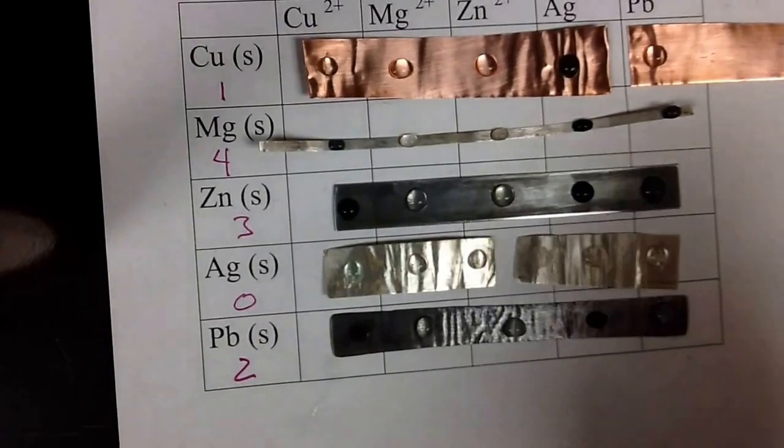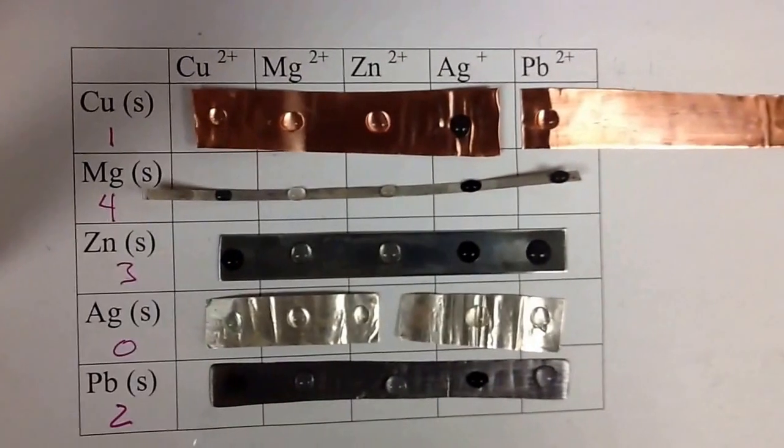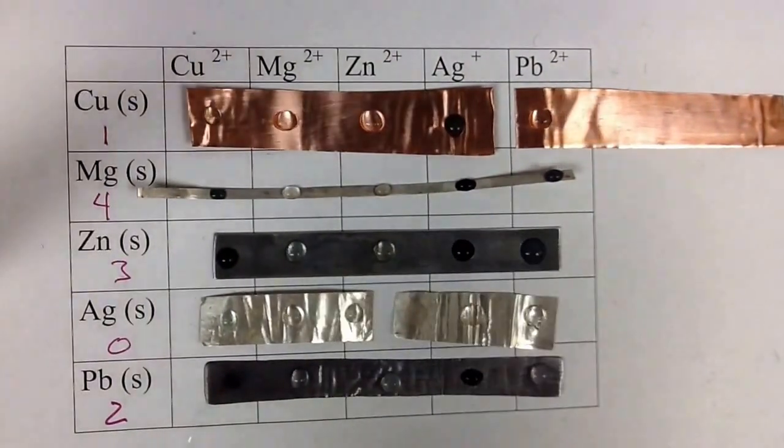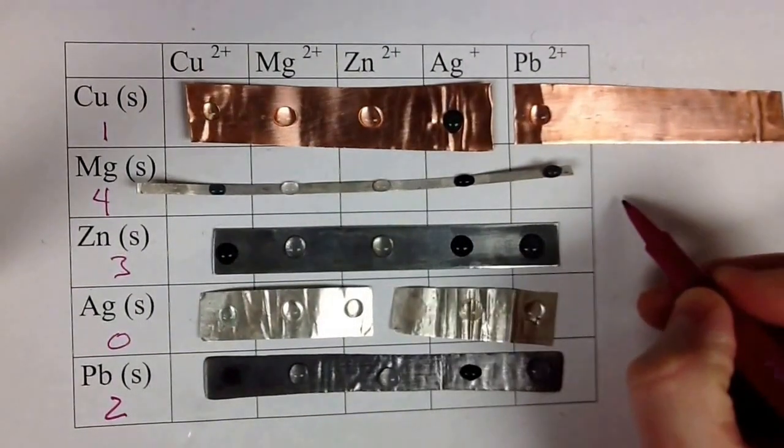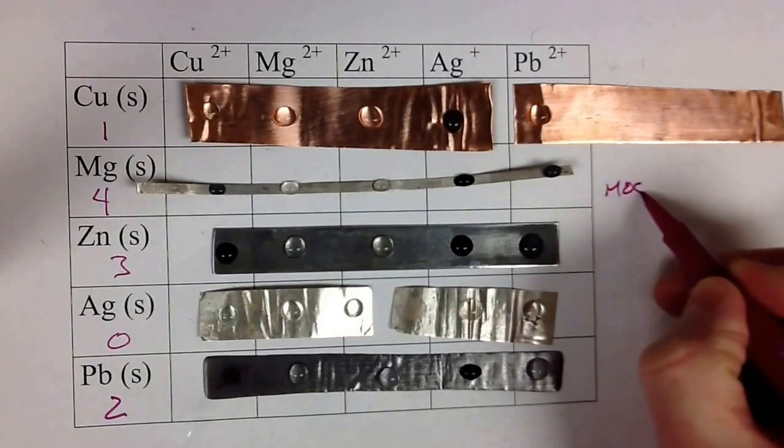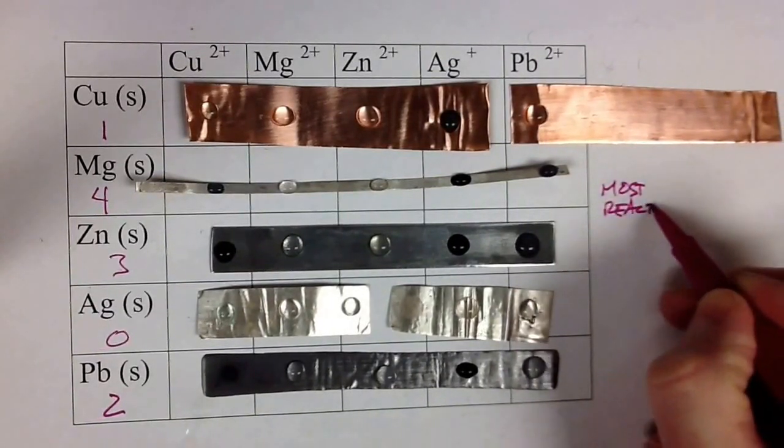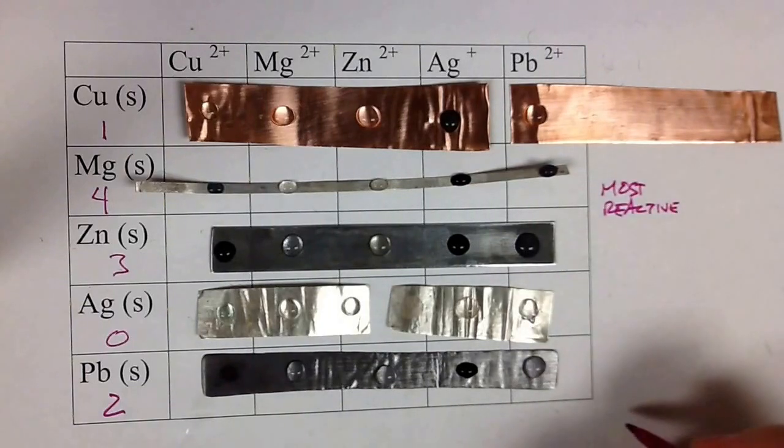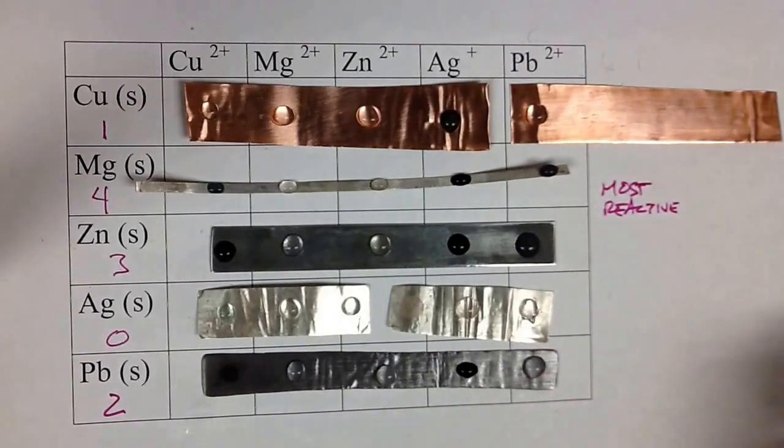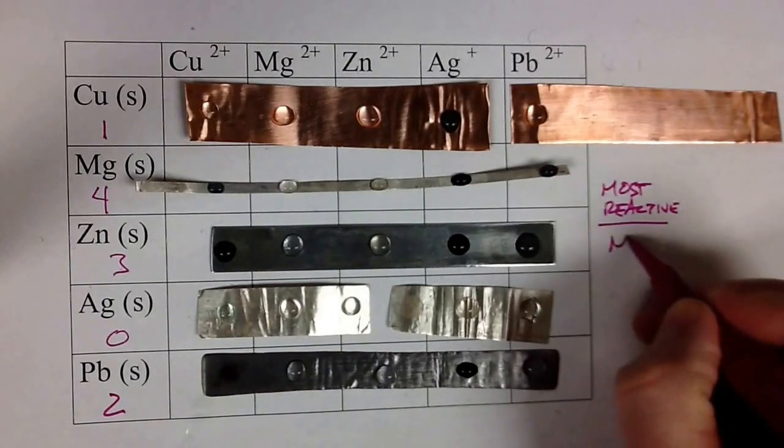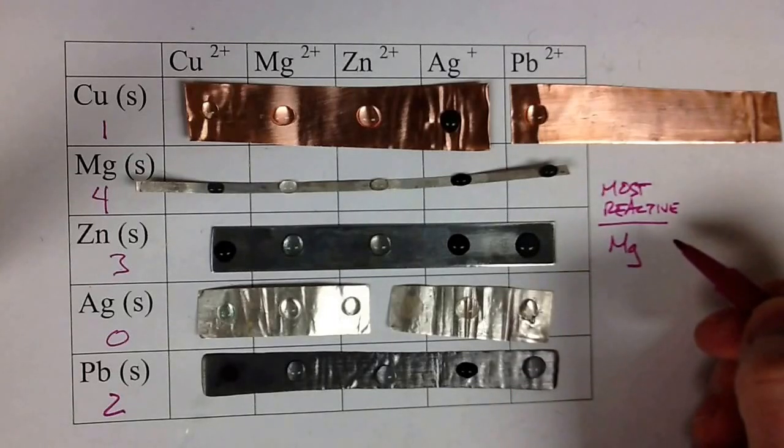So from this, what we can create is called a metal activity series. So from this, from the most reactive down to the least reactive. So our most reactive metal is magnesium because it had the most reactions. It had four.